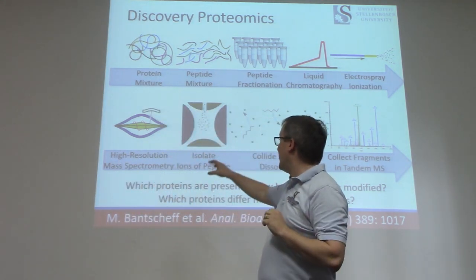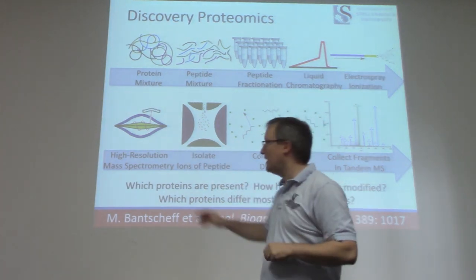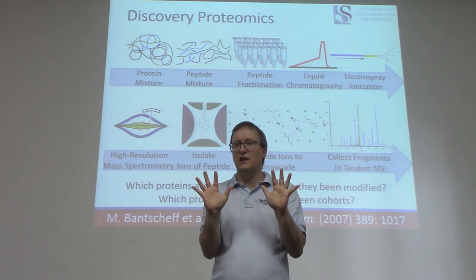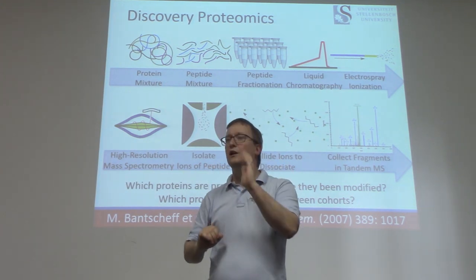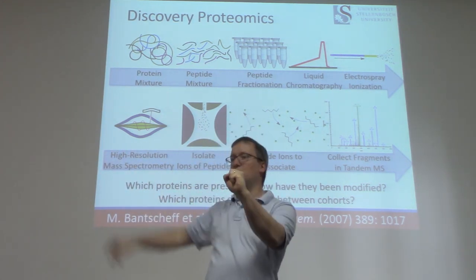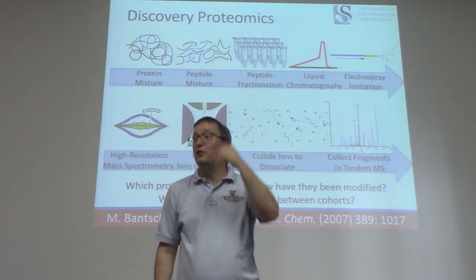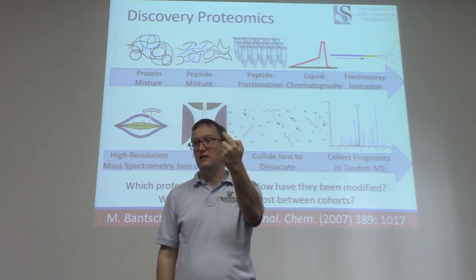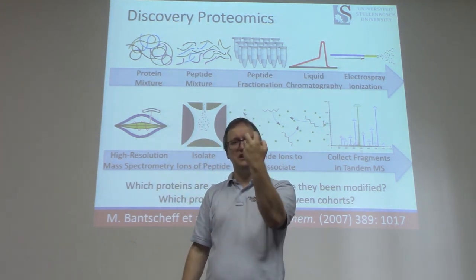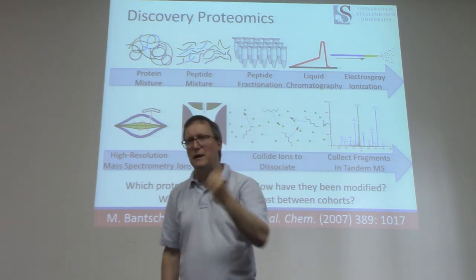But so the ions that are intense, we're going to serially isolate and fragment them. So we have an ion that appears pretty big in this mass spectrum. The instrument says, okay, I'm not interested in anything that doesn't have a mass to charge of X, where X is where that peak appeared. So you have all these other peptide ions in there, and the mass spec says, boom, you're gone, and the only thing that remains is that one peak. So this means that we have maybe several thousand copies of some particular peptide ion. We might have some commingling, that we have multiple ions at the same M over Z, but generally this sample is dominated by some number of copies of some particular peptide ion.